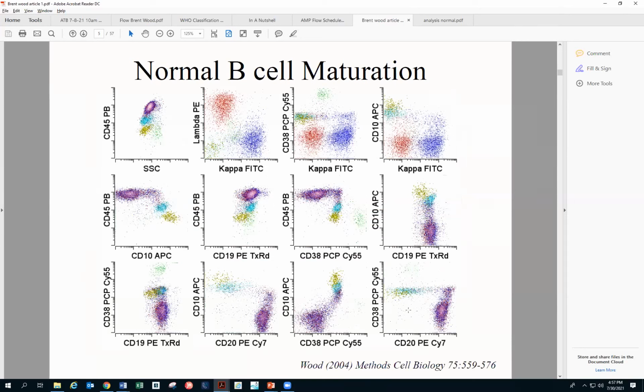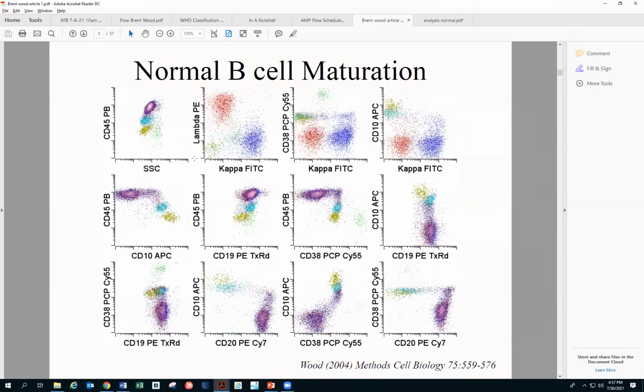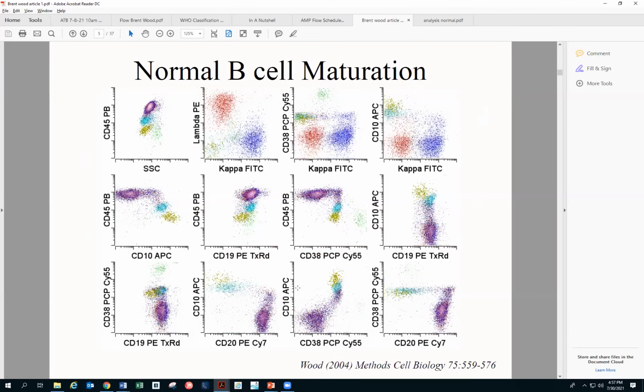And this will more confuse you. Let's see how we can go through this. The TdT again comes in the intracytoplasmic tube, remember that. So we don't have a TdT over here that comes in the intracytoplasmic tube. Now coming to CD34, they don't have CD34 here.